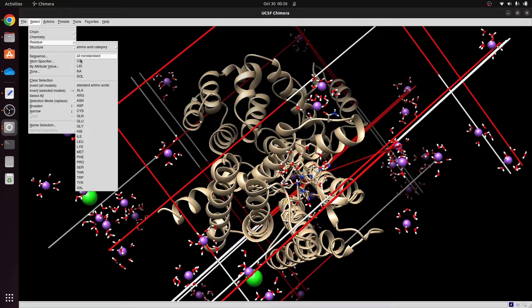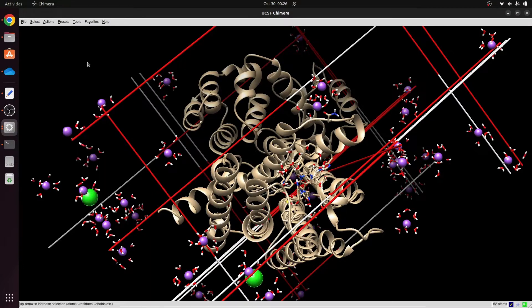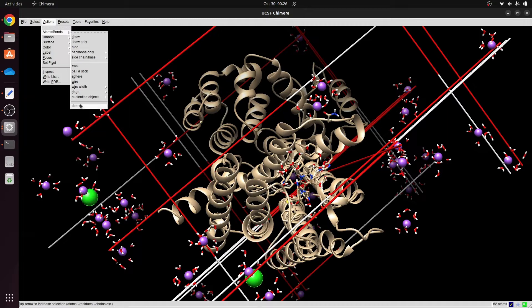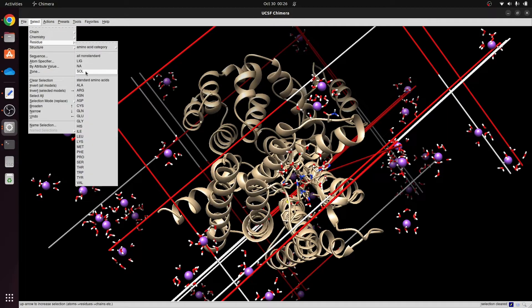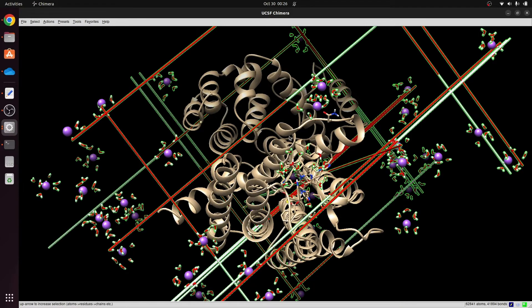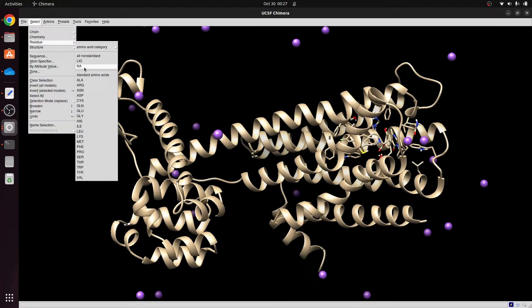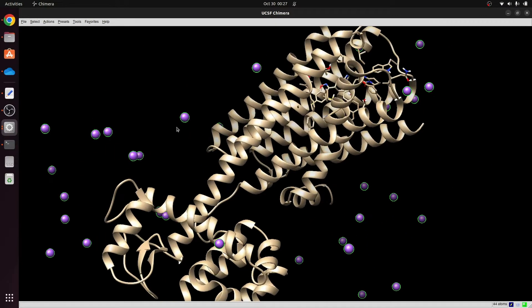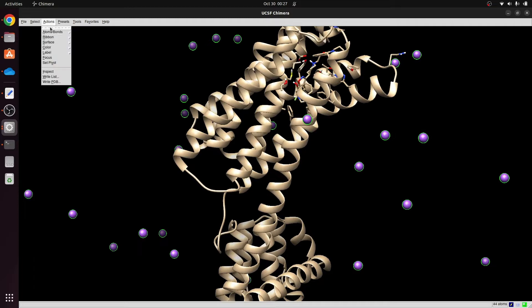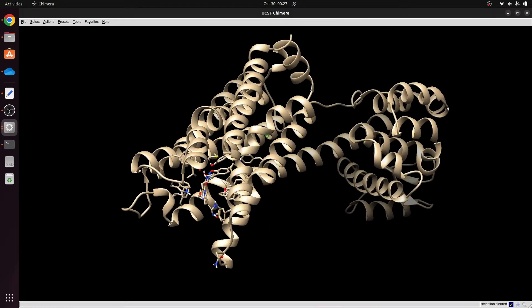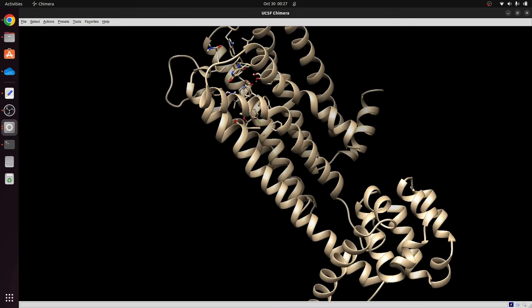I'll go to Select, then Residues, select Cl first, go to Actions > Atoms and Bonds, and delete it. Then I'll select the residue SOL, which selects all the water molecules inside the MD simulation box, and delete those as well. I'm then left with sodium ions shown as purple dots, which I also delete under Atoms and Bonds. Now I'm left with only the protein and the ligand.